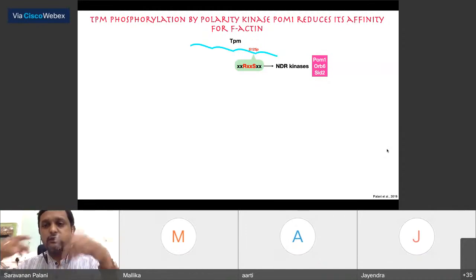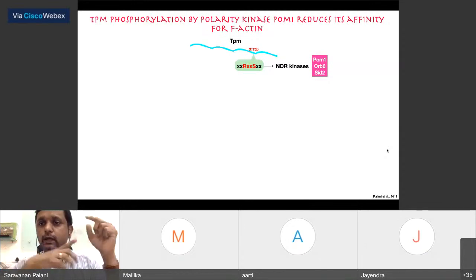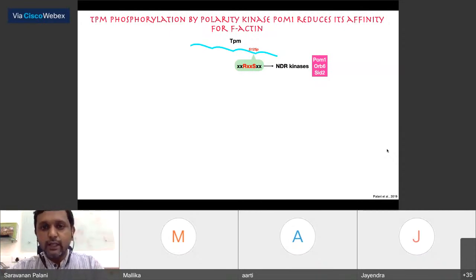Nothing works, because these proteins are all forming head to tail dimers, right? If you tag the N or the C terminus, you always have a problem. So you have to use a different way of tagging them, that means marking them with a fluorophore in order to do the kind of experiments you want to do, for example TIRF microscopy and so on. So in this case, I wanted to visualize tropomyosin on actin. Both of them are untouchables.